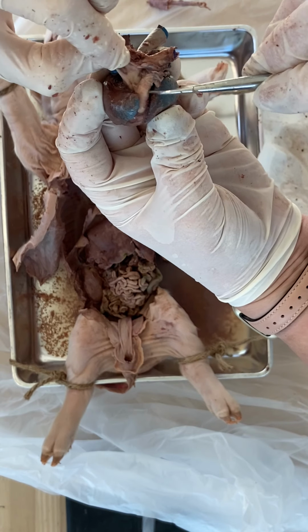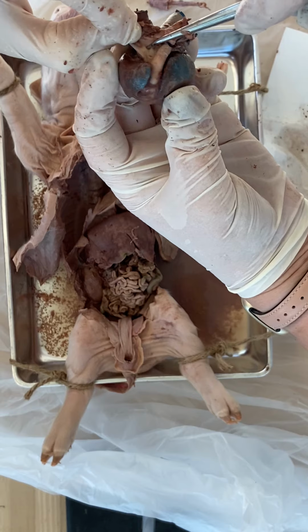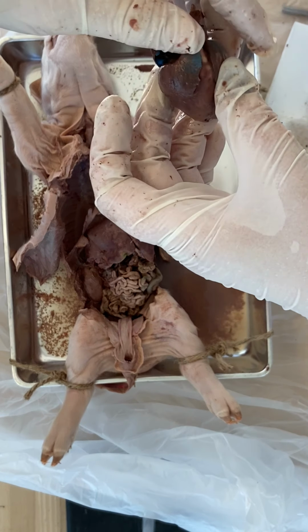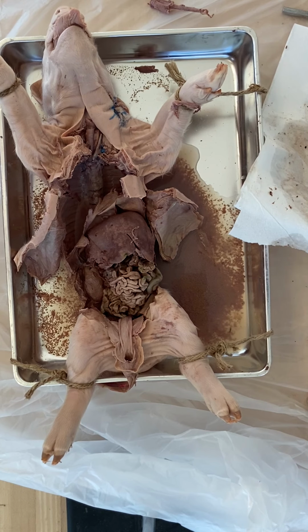So here's the pulmonary artery coming out to the lungs, and here is the aorta, which then comes down the back as the descending aorta. I wonder if we can cut off one of the atria and see a valve. I've never been able to see it, but if we can do that.